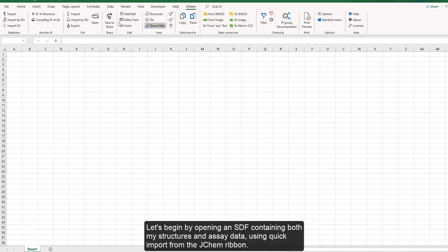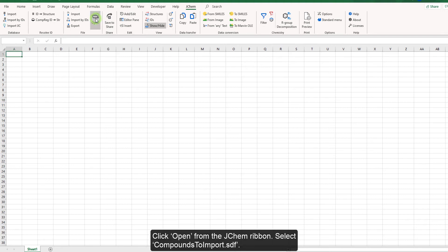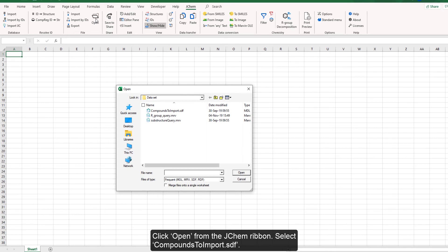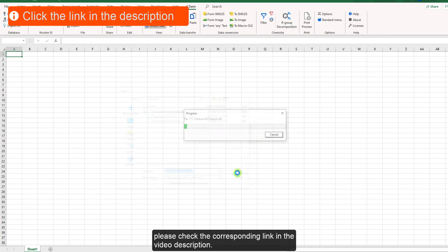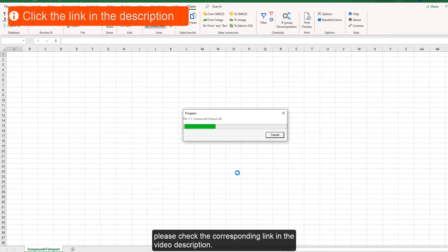Let's begin by opening an SDF containing both structures and assay data using quick import from the JChem ribbon. Click open from the JChem ribbon and select the compounds to import dot SDF file. For more information about other import options, please check the corresponding link in the video description.